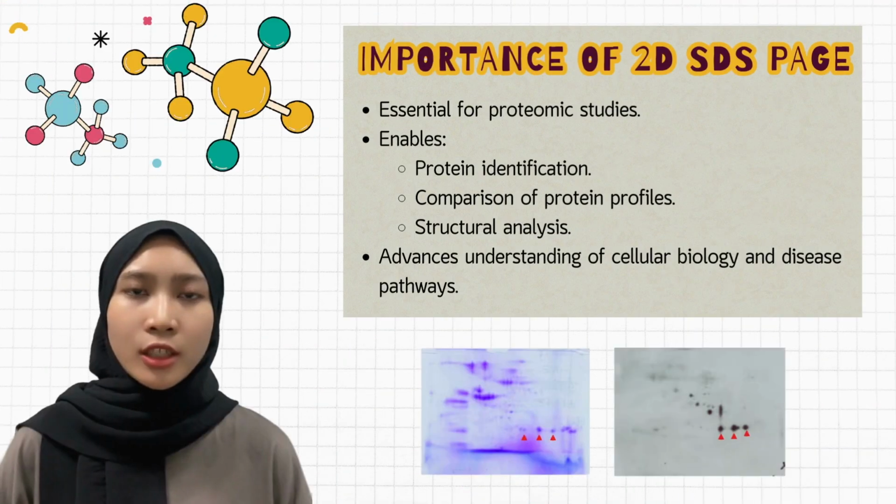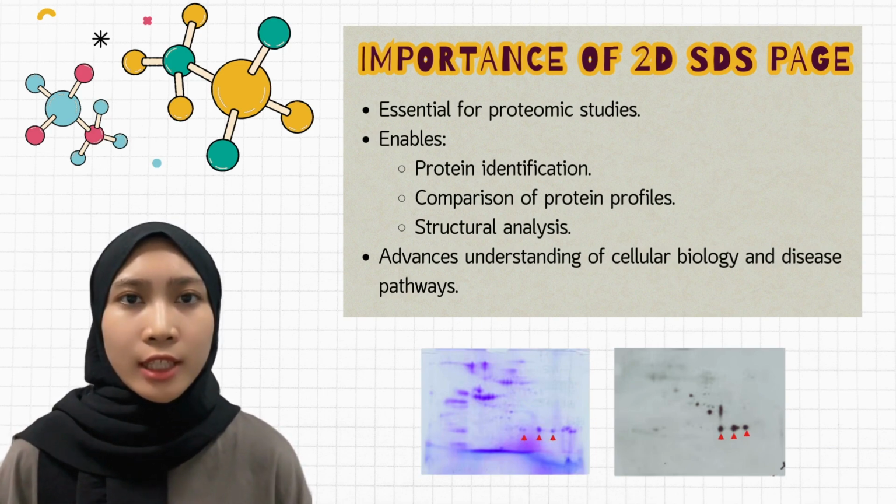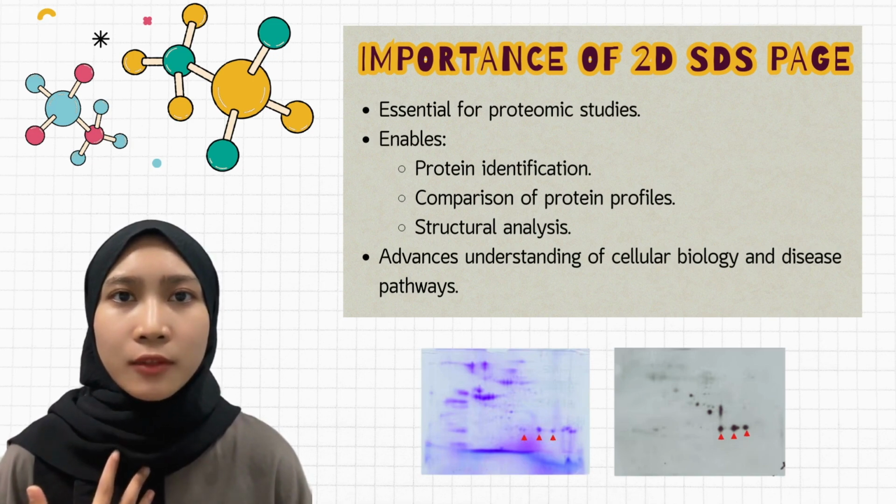And so, moving on, 2D SDS-PAGE is essential for proteomic studies, allowing for protein identification, comparison, and also structural analysis, thus advancing our understanding of cellular biology and also disease pathways.